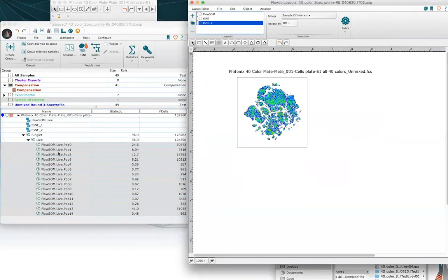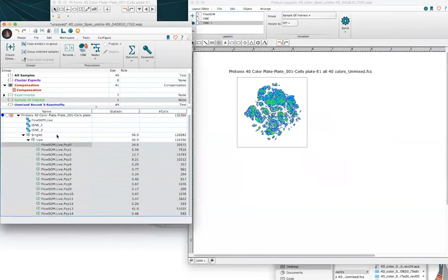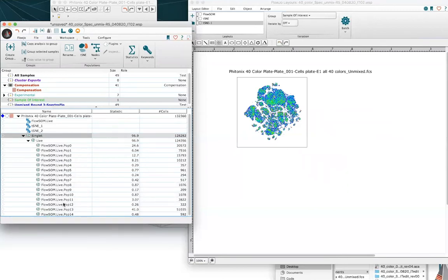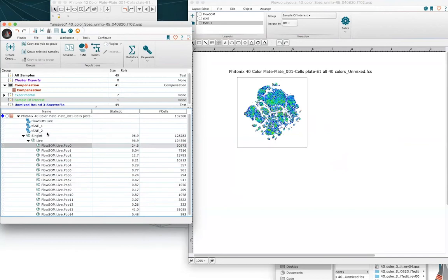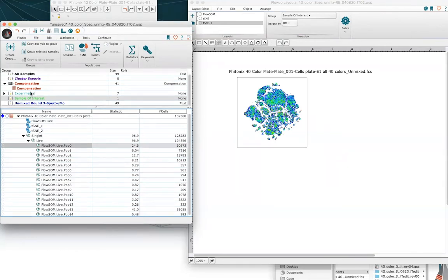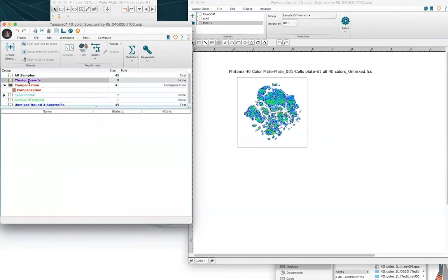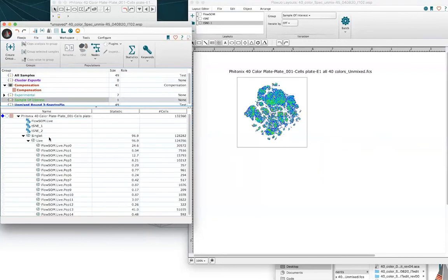Now I want to overlay each individual population one at a time, and that's where batching can really be a handy trick. Notice I've already set up a particular group called cluster exports, which I'm going to fill with our clusters.